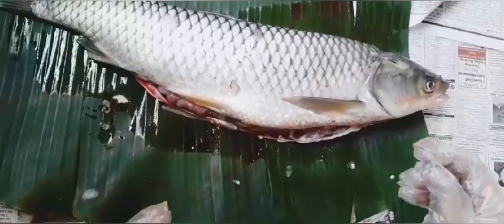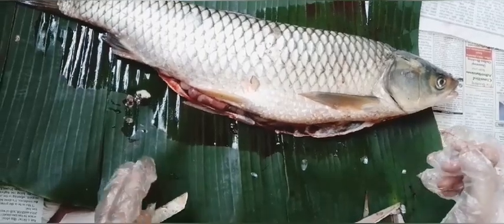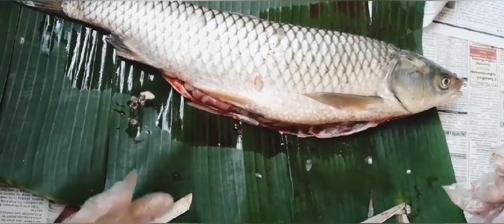So now, my mother helped me. So we have dissected this fish, and now let us see its internal organs.